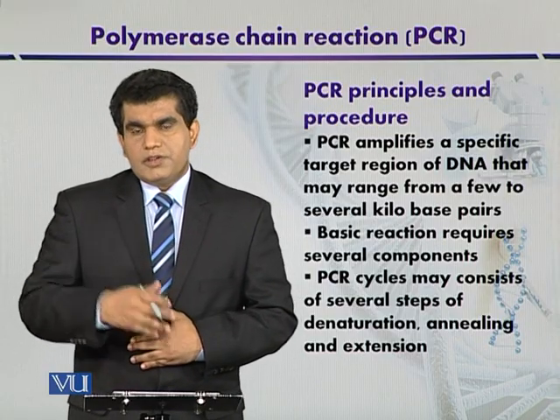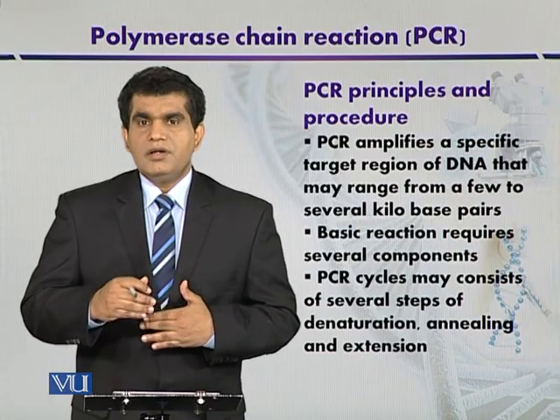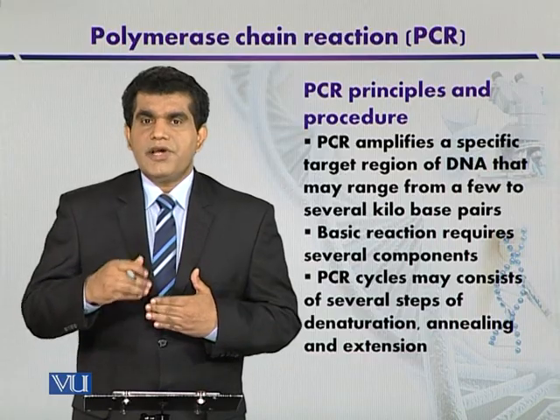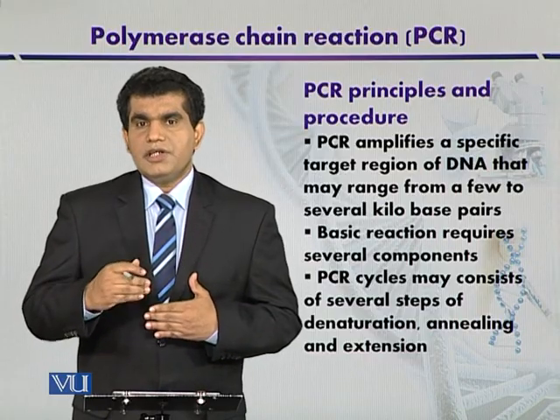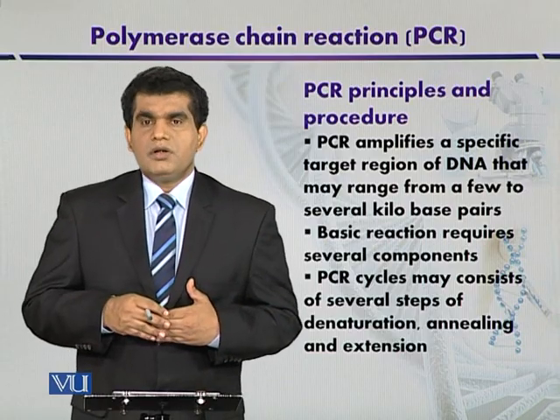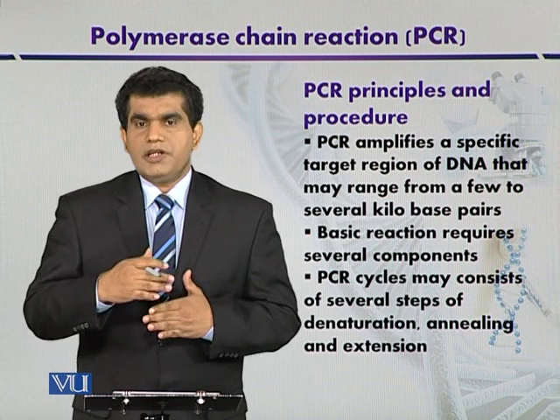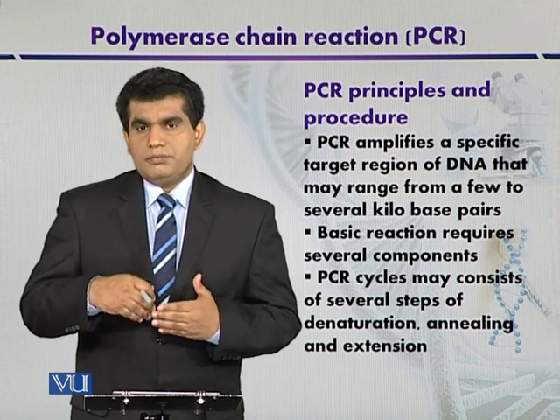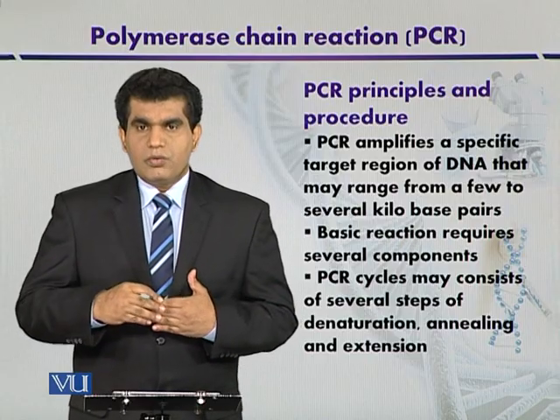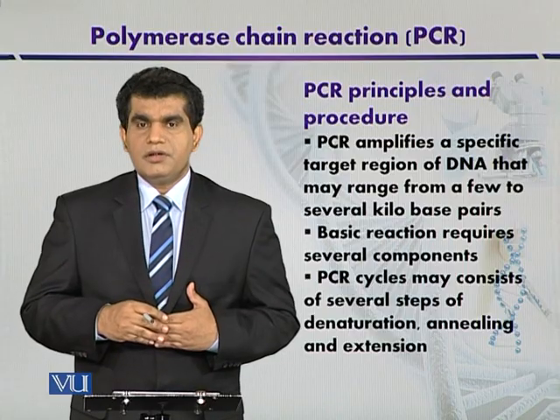So one of the initial steps in PCR is the initialization step, where the reaction mixture is heated at a very high temperature, like up to 96 or 98 degrees Celsius, ताकि इसमें जो DNA polymerases हैं वो activate हो जाएं, and it can also cause the denaturation of the DNA.